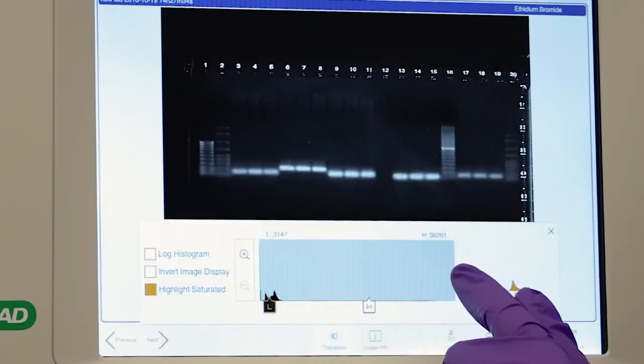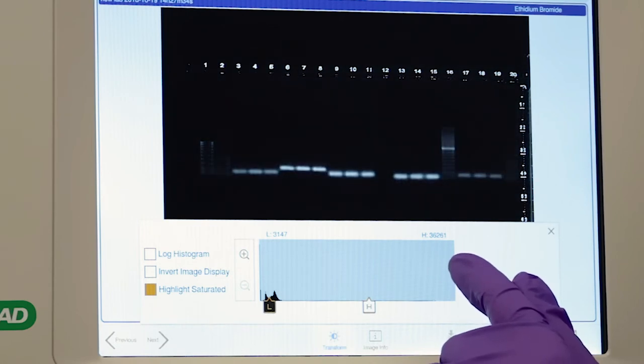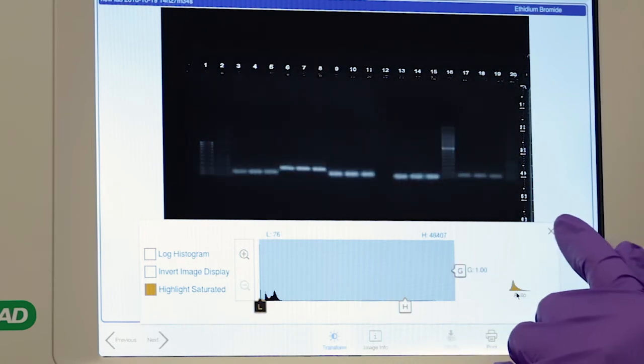To adjust image appearance, the adjustments will automatically be saved, but the actual data will remain unchanged.